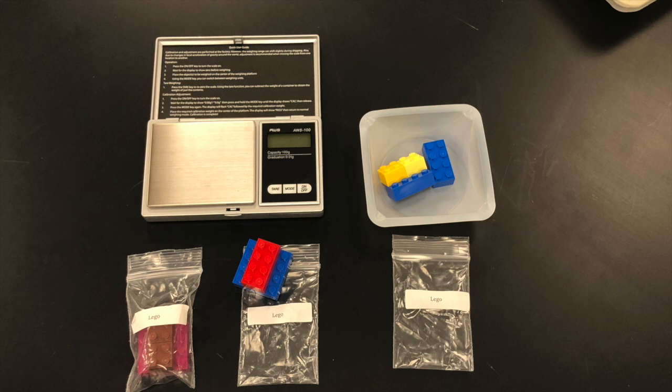After recording the initial data, the experiment portion is done. The rest of the lab will involve doing calculations.